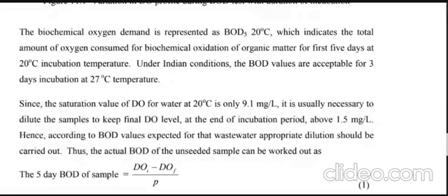Okay, so for that we can write it as BOD3 at 27 degrees Celsius. It may be the test for 3 days or 5 days. Most of the time we carry it out for just 5 days. Now, this is one of the matters: the temperature is important and the time is important, because we know that the rate of reaction depends on temperature as well as time.